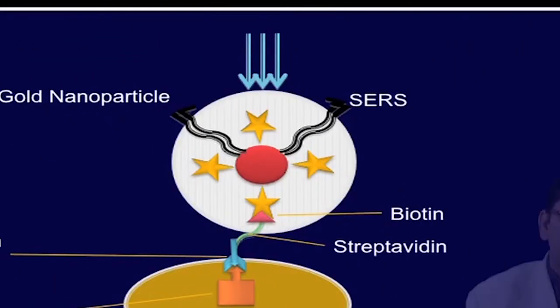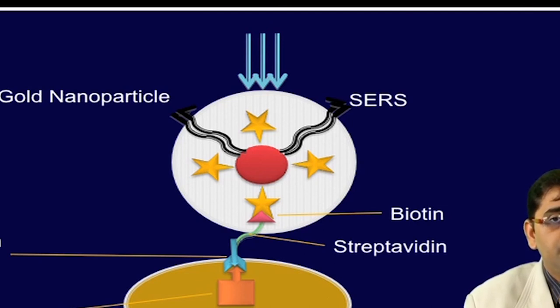Let us discuss gold nanoparticles, GNPs. The excitation of coherent electron oscillations that exist on the interface of two materials is known as surface plasmon resonance, which forms the basis for the use of gold nanoparticles as a detection system. The proportion of light absorption to scattering depends on the size of the nanoparticle. The large nanoparticles can be used for biological imaging due to the need for a high scattering cross section. The GNPs labeled with suitable capture molecules exhibit a change in the emission spectrum of scattered light upon binding to the analyte of interest from a protein mixture due to specific biomolecular interactions.